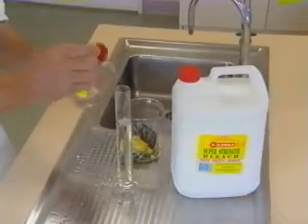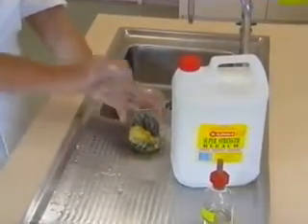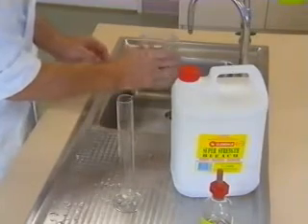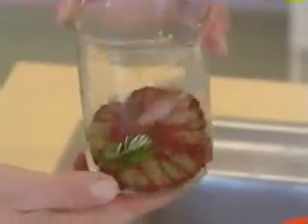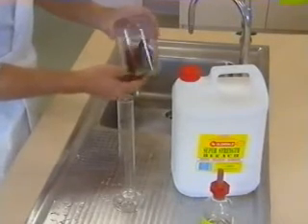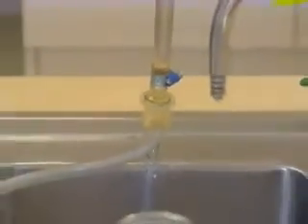To this solution also add a drop of wetting agent, such as Tween 20 or Triton or any non-ionic detergent. The surfactant or wetting agent will improve the surface coverage. The plant material can be washed in this solution for 5 to 20 minutes and sometimes even longer. Modifications to this basic procedure that can be used to improve efficiency include mechanical agitation and use of vacuum, as demonstrated here.